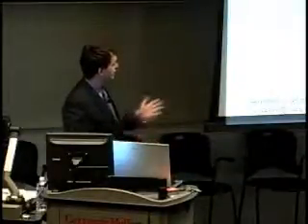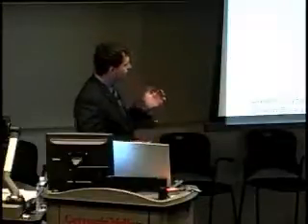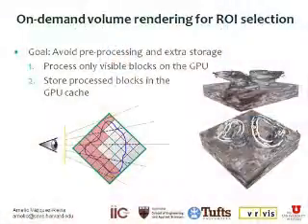The second component of the workflow is the part in charge of the interactive segmentation of neurons. In this part of the workflow, the user can interactively segment axons in a semi-automatic manner as she flies through the data. And the last component of the workflow is neuron reconstruction. Once we have the segmentation results, the question is how do we collect this data and compress it for visualization and storage. So let me go through each of these components one by one.